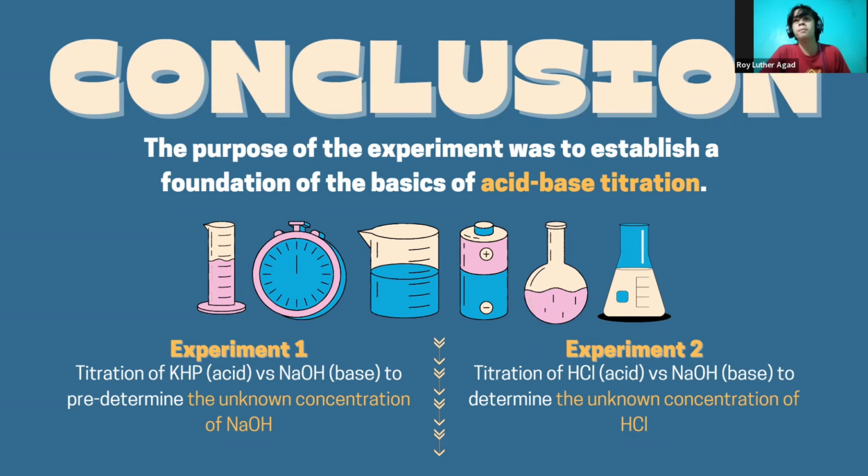With the presence of a popular indicator, phenolphthalein, the tested solution was expected to switch color mid-process at the endpoint, which should symbolize the point of acid neutralization by the base. This was, however, satisfied in the conduct of this experiment.